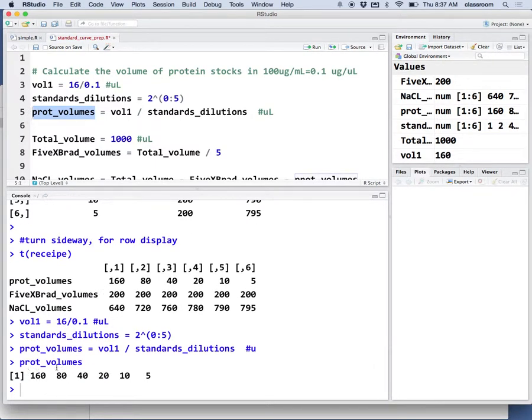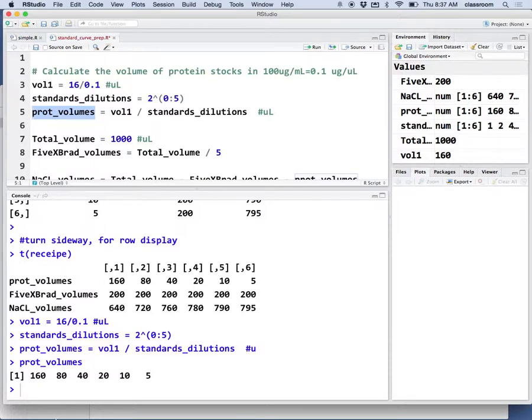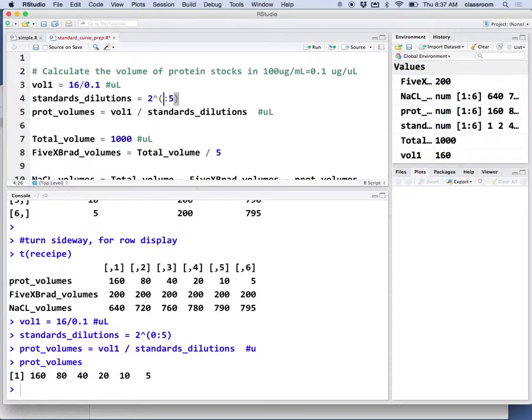160, 80, 40, 20, 10. I realized in your protocol we need a 0, so I'm going to change this one a little bit. That would be 0.